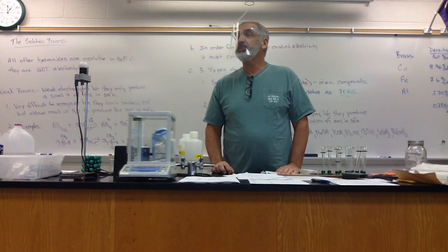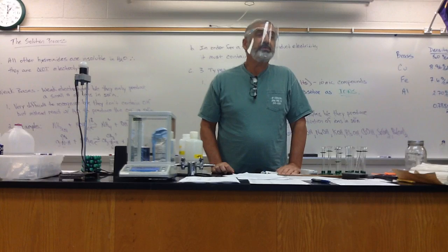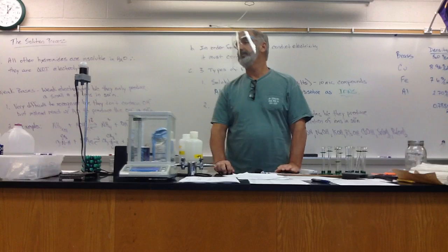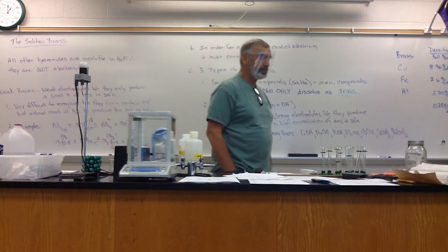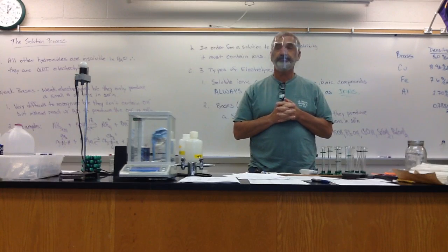The hypothesis should be on the 3rd page, which is front and back. So front is 1, 2, and the hypothesis is which one do you think is the most dense? And just state which one you think is most dense and why. Now, if you're calculating density, what are we going to have to measure? Mass and volume, since density is mass divided by volume, right?